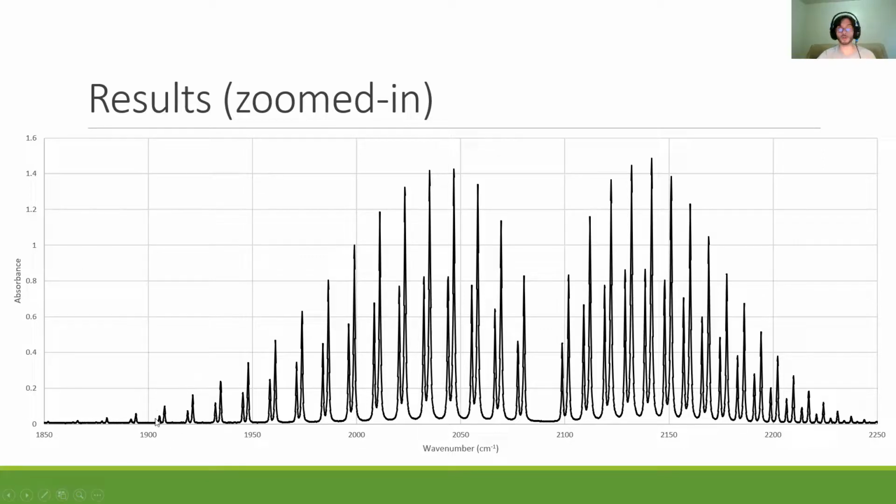So there just isn't much to start with here to transition, which makes it an unlikely transition to happen, rather than say here, where it is a higher energy, but there's much more in the population there at room temperature. So then as we go on, energy starts to take over, and it just becomes less likely to happen. So that's why we get these general shapes.